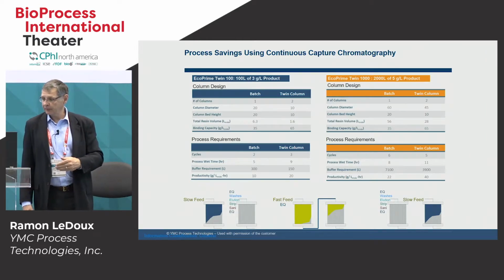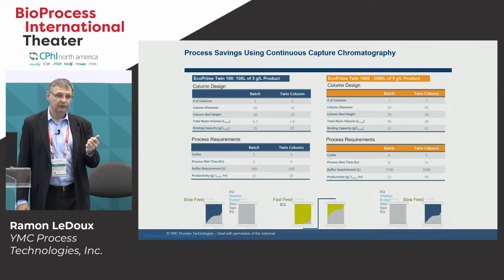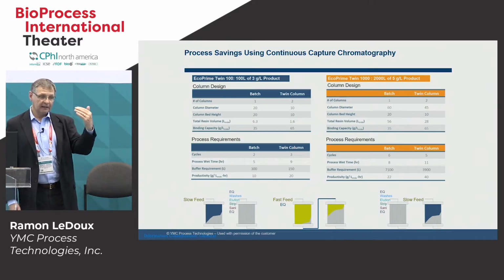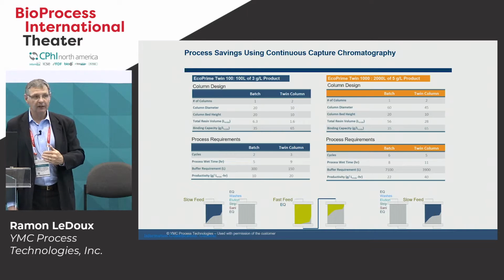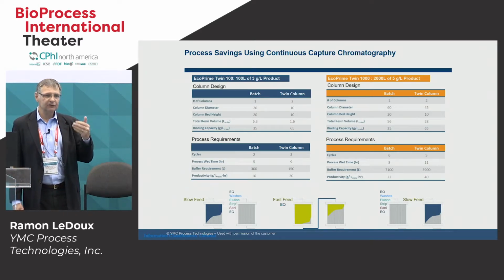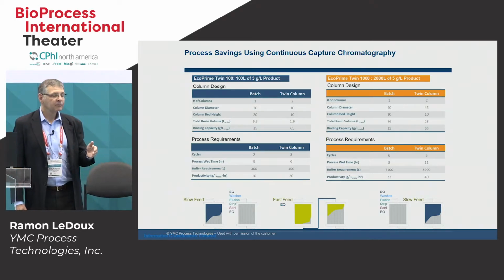Our second application is a 2,000 liter fermentation or bioreactor run at 5 grams per liter. And again, you get similar data results, right? We went from a 60 centimeter column down to 45. Again, we tried to standardize on 10 centimeter column lengths. We keep that fairly consistent between applications on scale up. But our total resin volume, you can see, goes from 56 liters down to 28 liters. So about a 20 plus liter resin savings, which, when you're talking about a $14,000 to $15,000 per liter resin, is fairly significant.